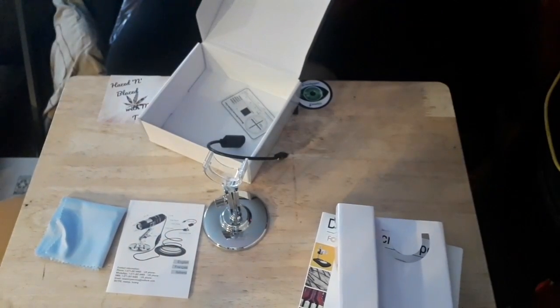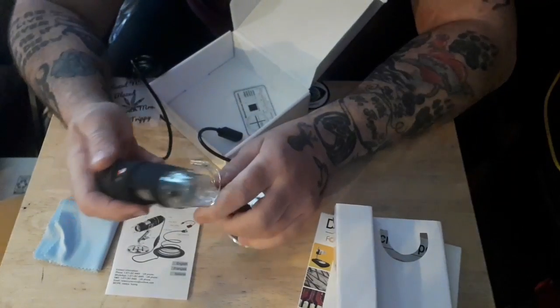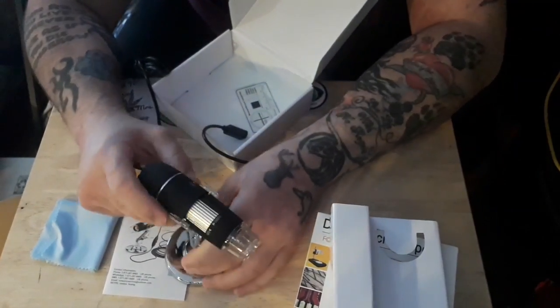You have your microscope — whoa! I just peeled something off. It looks like there might even be lights in it. Excuse my French. There we go. The microscope — it looks like it clips. Yeah, heck yeah.